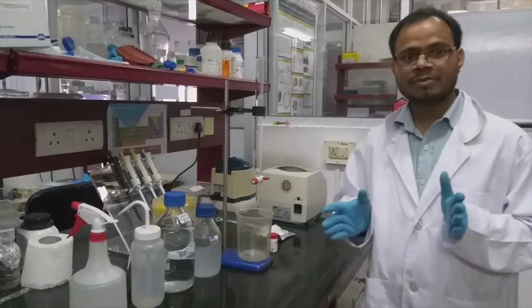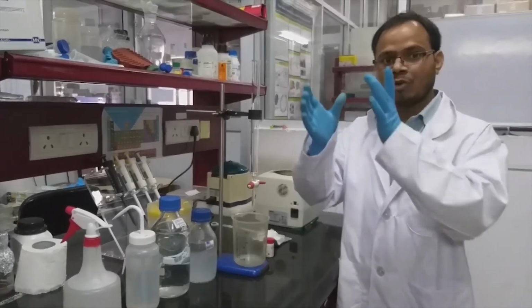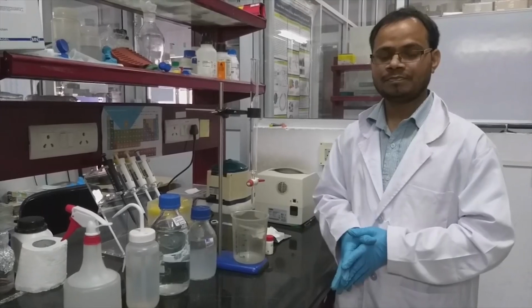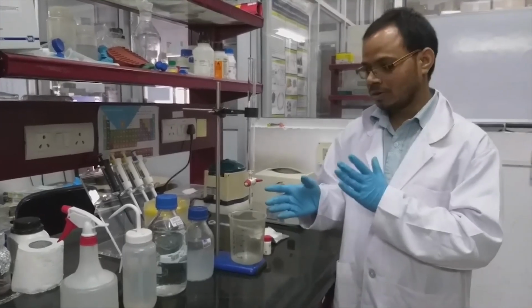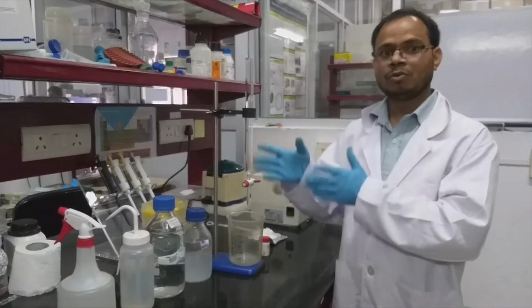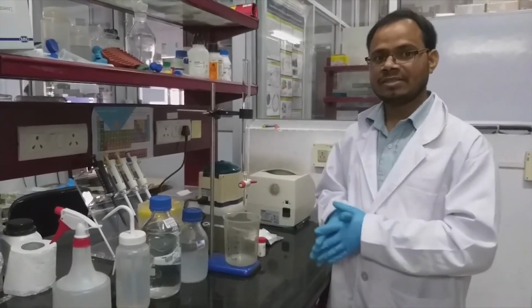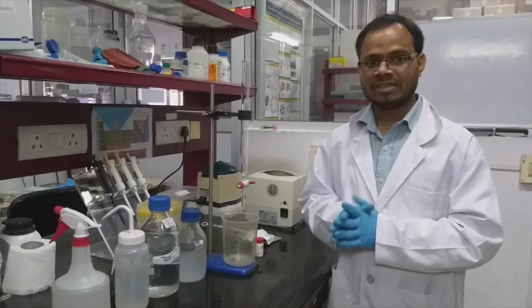In this video we will show you how to pack the column first, what buffers are required, and how we will demonstrate eluting two different molecules. One is of larger size and another one is of smaller size. So let's start the packing.